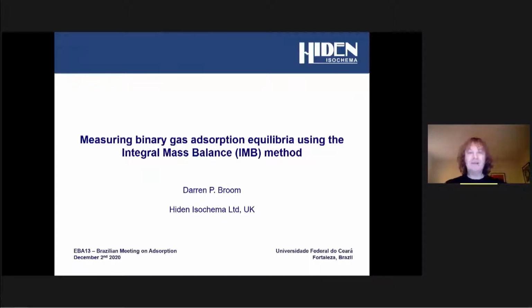Great. So good afternoon, everyone. My name's Darren Broom. I work for Hiden Isochema in the UK. We're a manufacturer of gas and vapor adsorption instruments. And I'm going to talk to you about measuring binary gas adsorption equilibria using a new technique we've developed called the integral mass balance, or IMB method.